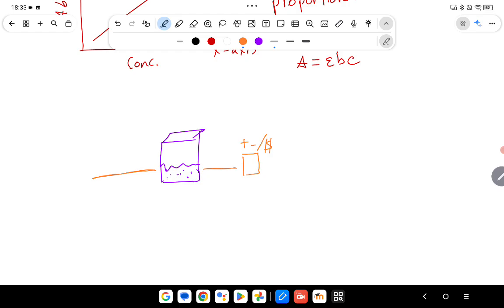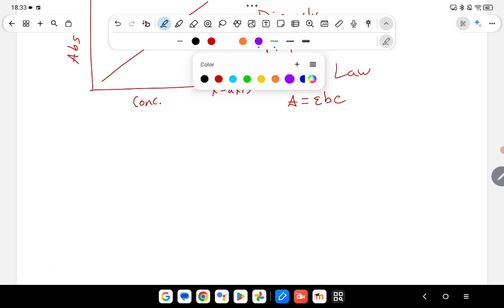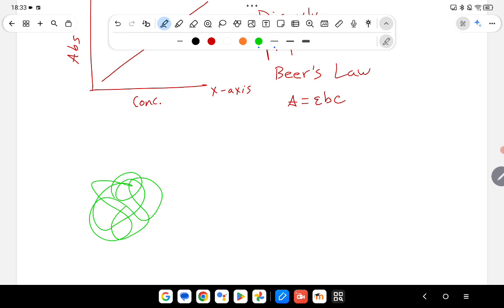So the dye, we used a dye for this lab as well, Coomassie blue. Remember I said, if you have a protein, this dye has a universal effect on all protein in a sample, even though all the proteins look different, because it binds to, I think, 4 amino acids.